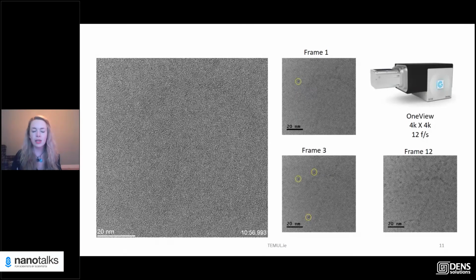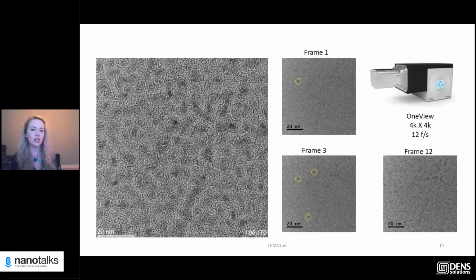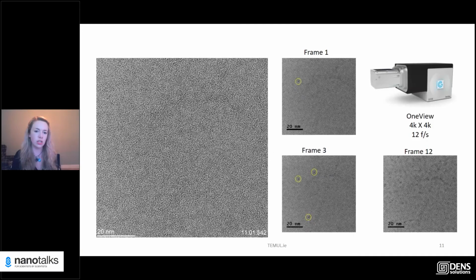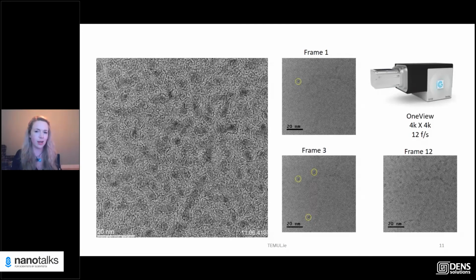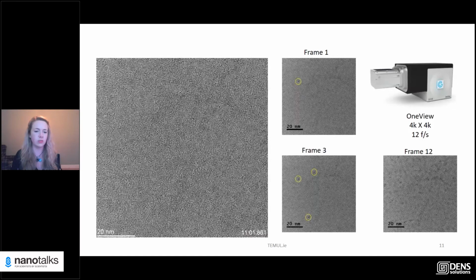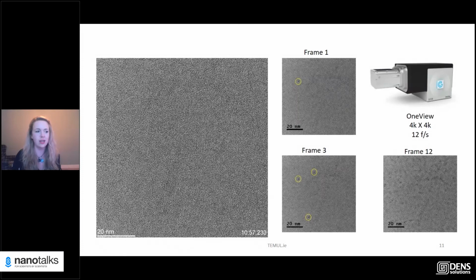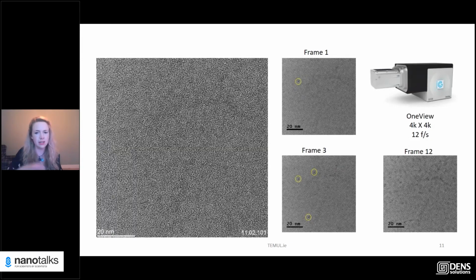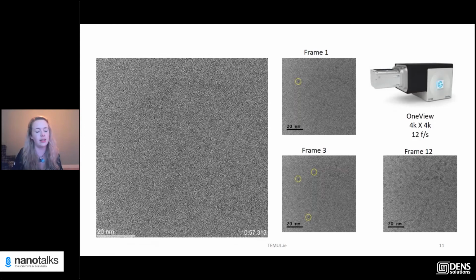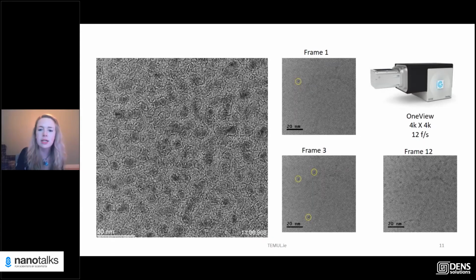Okay, so then after a lot of work playing with the different types of applied voltage, we were able to capture that phase transformation from amorphous to crystalline. But not only that, we're able to capture the initial nucleation stuff. And that's really what I wanted to get at. And so it's an experience with a wonderful group, Professor Jim De Yoreo, Pacific Northwest National Lab, and that's really what they're always looking at. What happens at the start? Because the crystal growth is really interesting, but really what's the physics that's happening right at the start of the formation of these little nucleation particles.